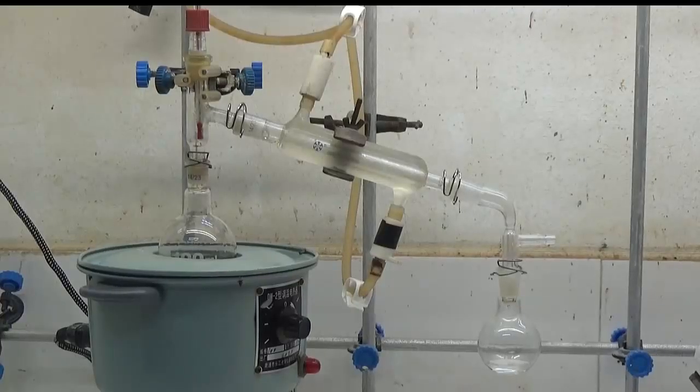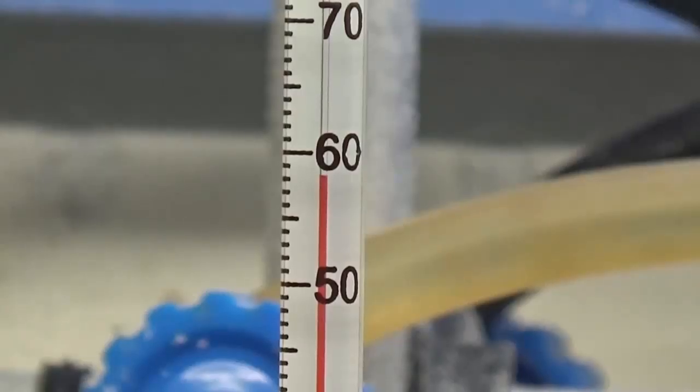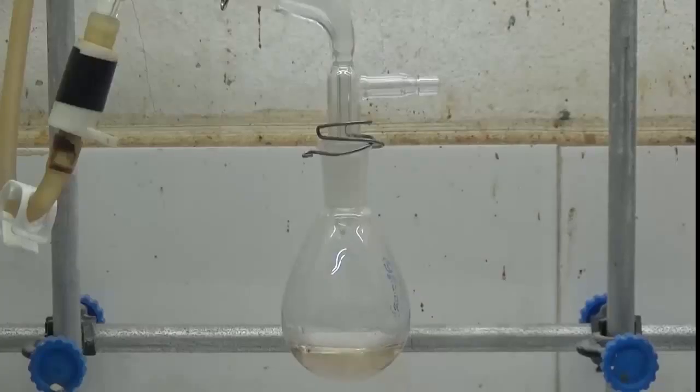Filter again and distill dichloromethane and furfural. The boiling point for furfural is 162 degrees Celsius. Collect the distillate at 155 to 165 degrees Celsius.